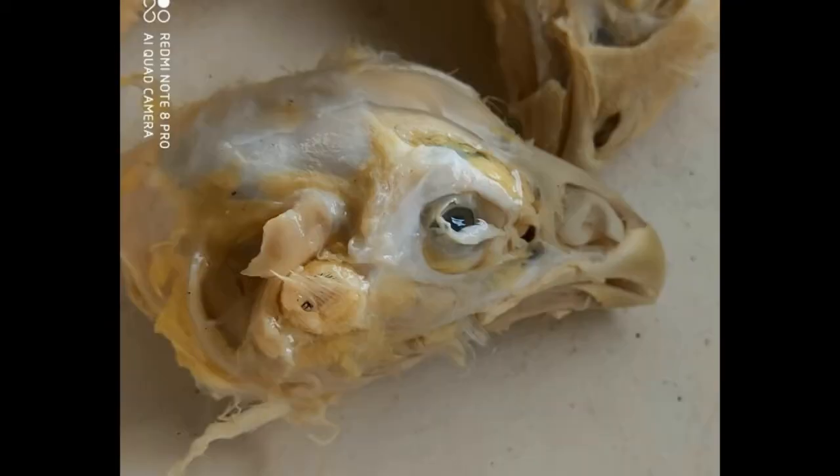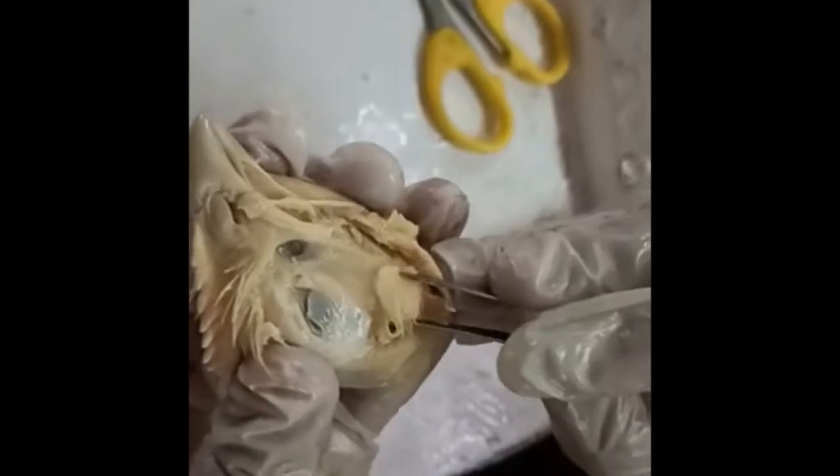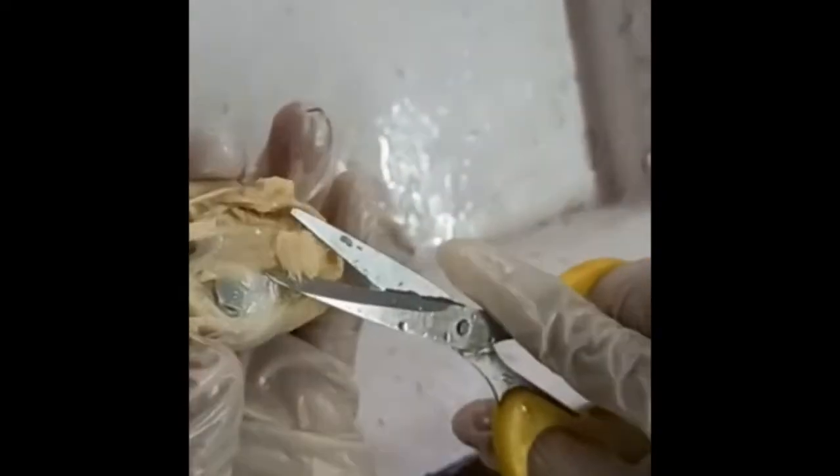We mount the columella from a fowl head which is preserved in formalin. For mounting, first we have to locate the ear. The ear is present behind the eye.